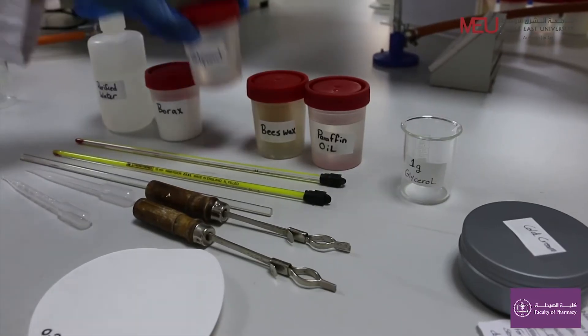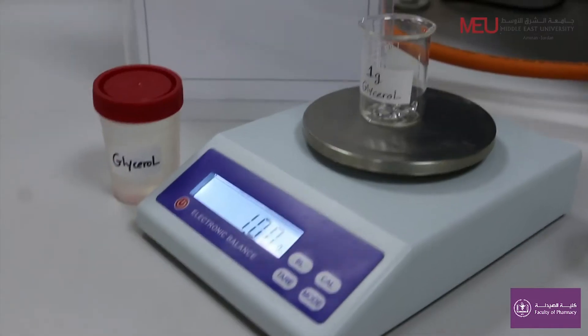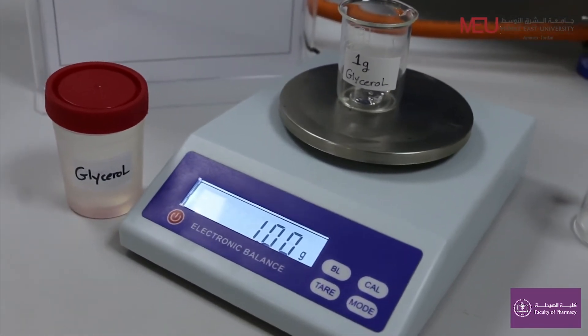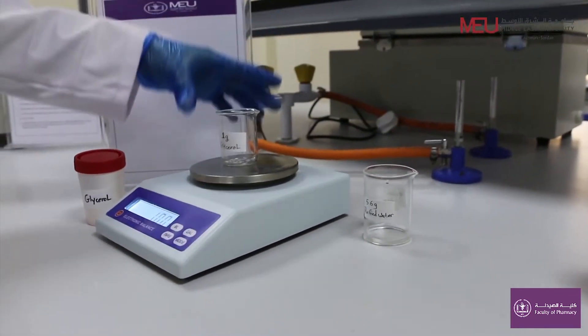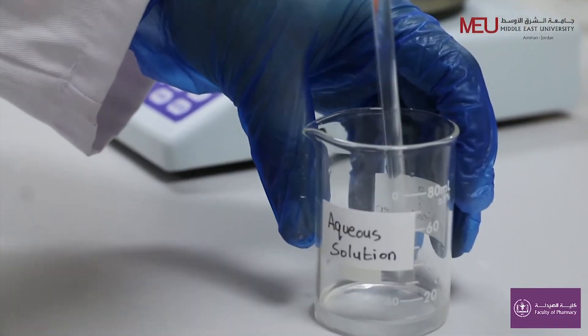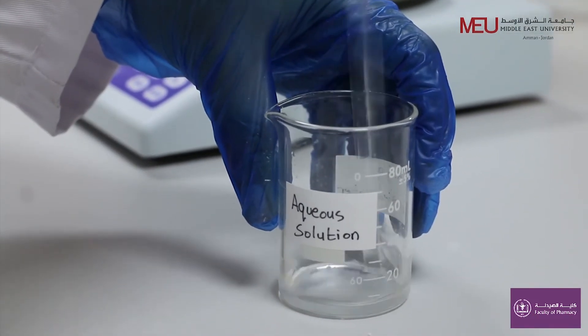Weigh 1 gram of glycerol. Here, glycerol is used as a lubricant, humectant, and preservative. Thus you have prepared the aqueous solution consisting of borax, purified water, and glycerol.